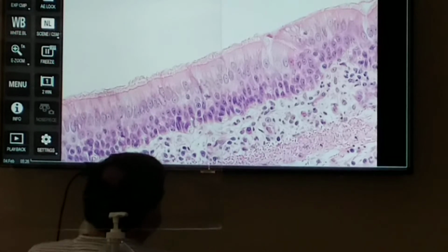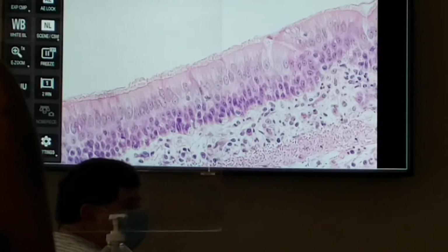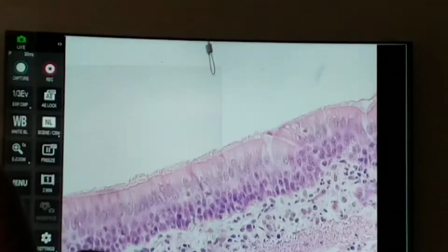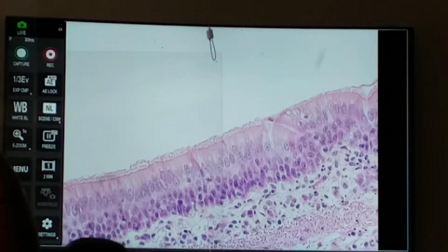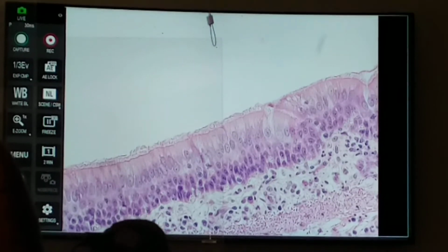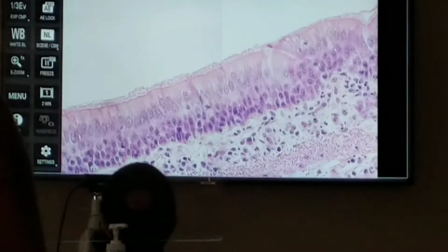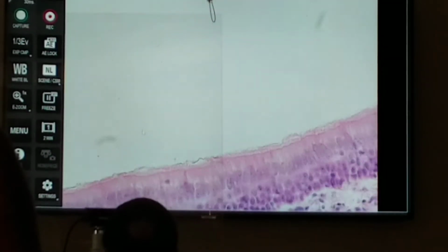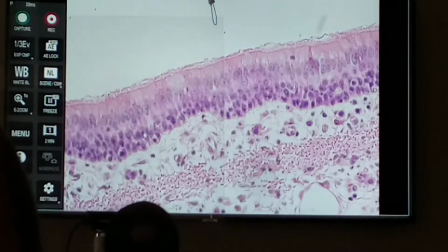So, the esophagus and trachea are right next to each other. The trachea is more anterior, the esophagus is posterior to it. So, they can take a slice through that section of the mediastinum and pick up both organs, both the esophagus and trachea. And the cilia, these are cilia that line the apical surface, they have a more scraggly appearance than does a brush border or microvilli.